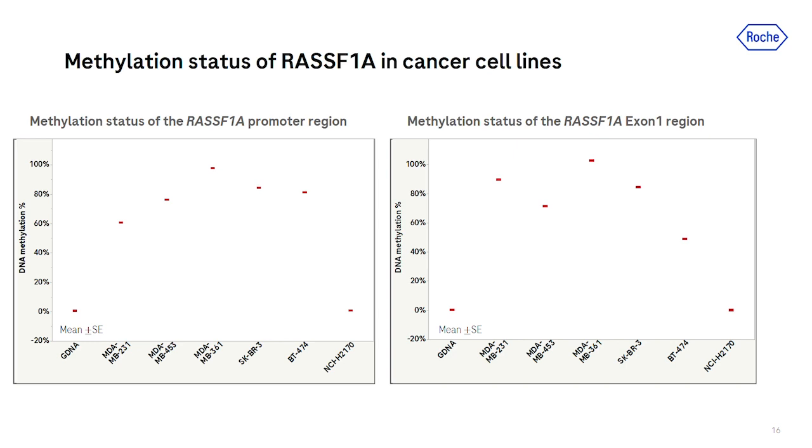In the exon 1 region to the right, different levels of methylation could be detected using the same cancer cell lines. Other studies, including this one, observed different methylation status of RASSF1A between the promoter and exon 1 region.